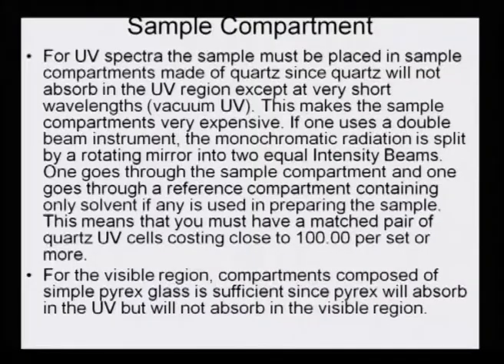Why? Because quartz does not absorb in the normal UV region. It absorbs only at very special vacuum UV wavelengths, or very short wavelengths, and that is not the region of study anyway. This makes the sample compartments very expensive.